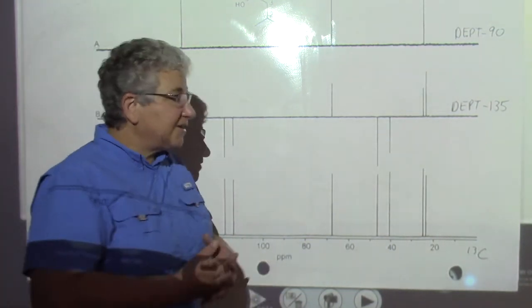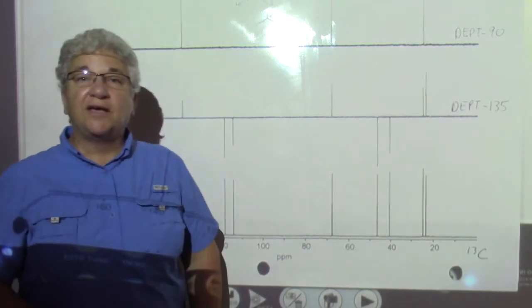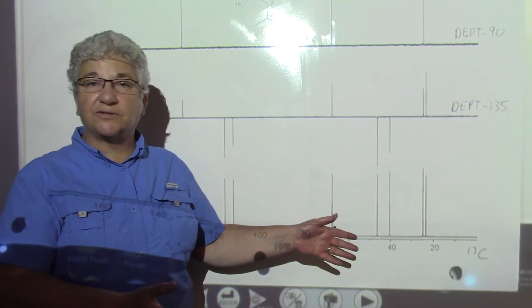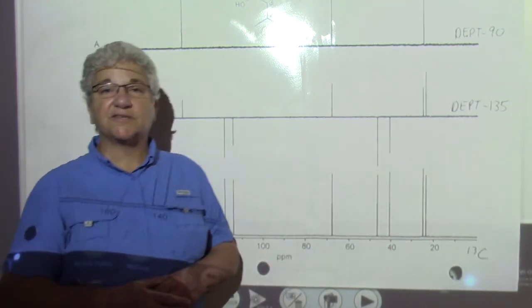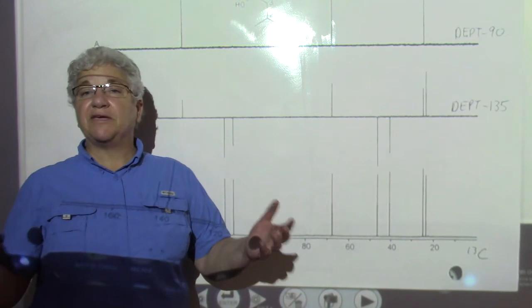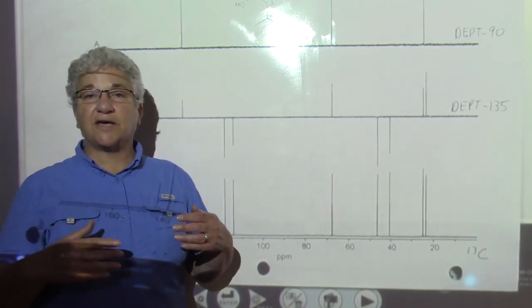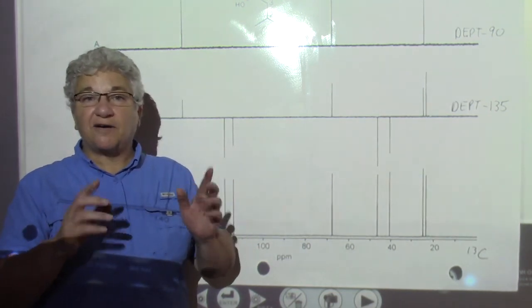And so the reason you're going to need to use this DEPT information is because you found out by looking at the structures of the molecules that you will form in this experiment that they have the same number of carbons. So just simply running a C13 isn't going to be enough. And so now you have to go through each one of your molecules and say, okay, for this first molecule, in a DEPT 45, look at its structure.